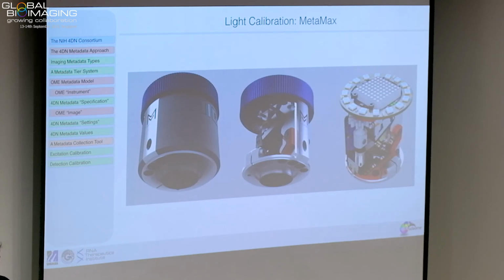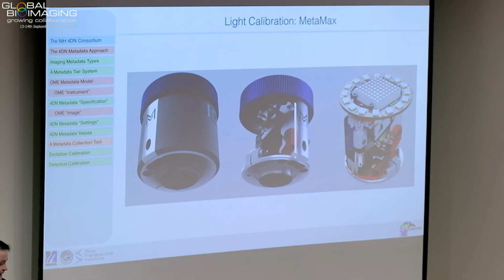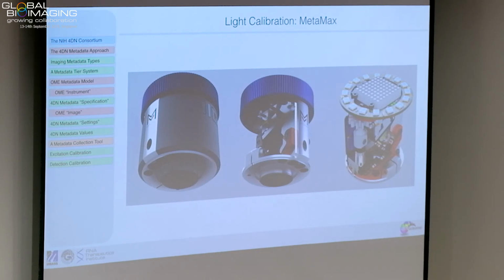Together with the spectrometer, you can estimate your wavelengths pretty reasonably. That whole thing does this analysis right away online. It's OME compatible, and so you get just the response file back from the cloud, and here we go. This is what we're assembling now for the next round of tests.